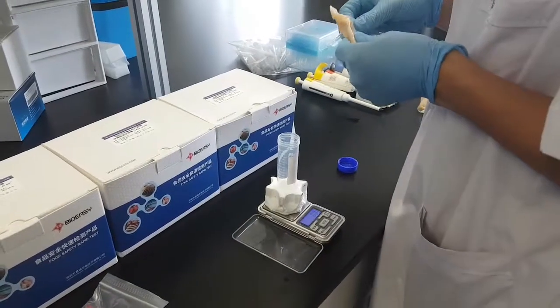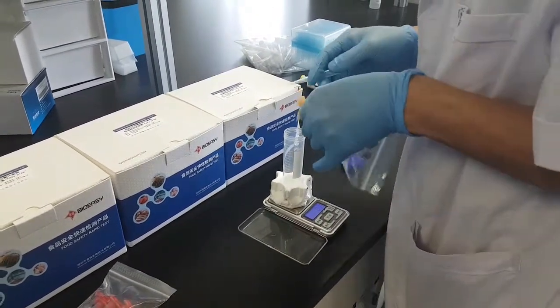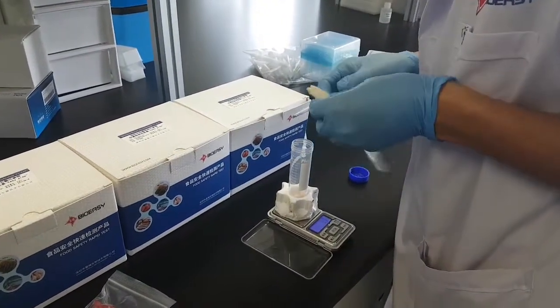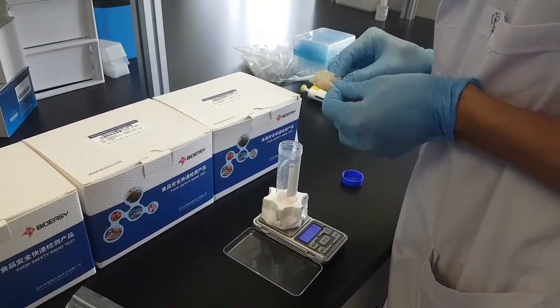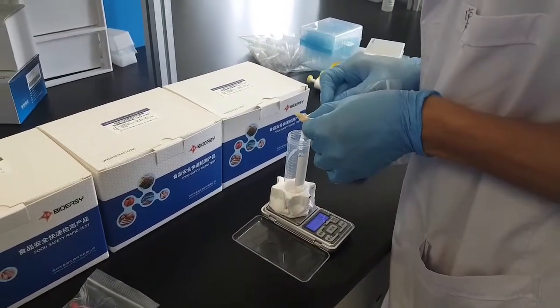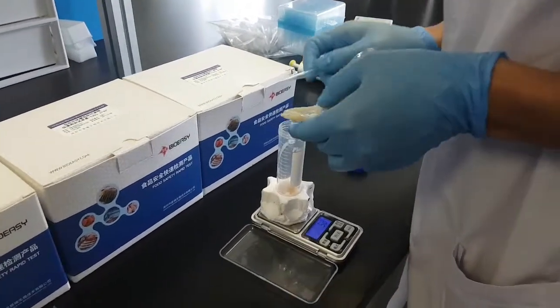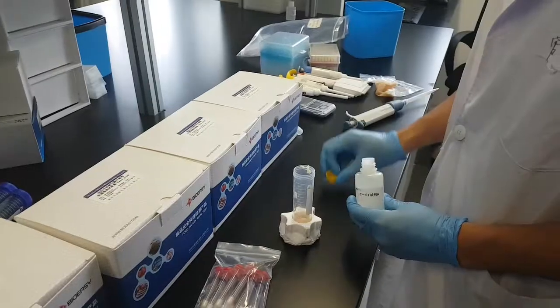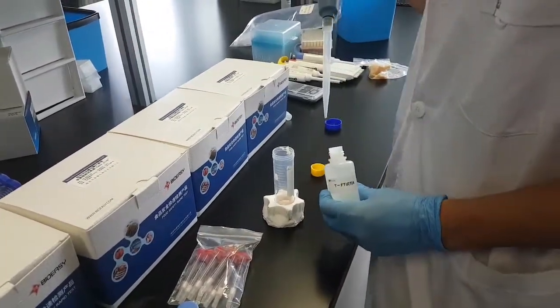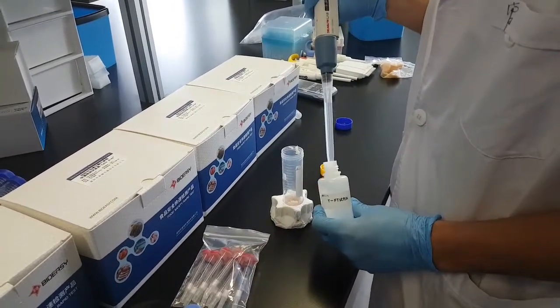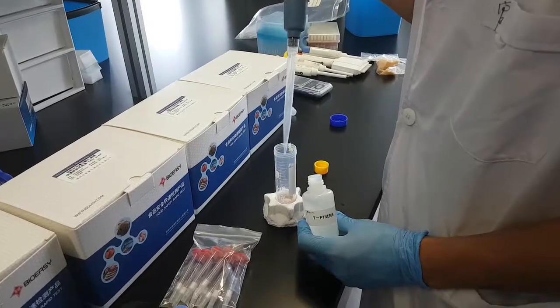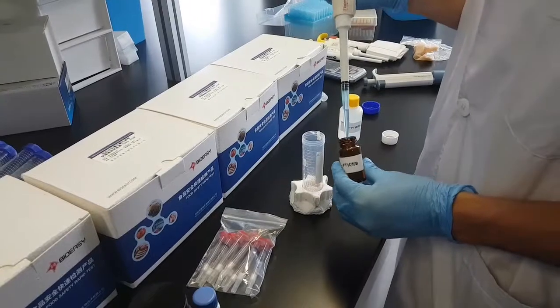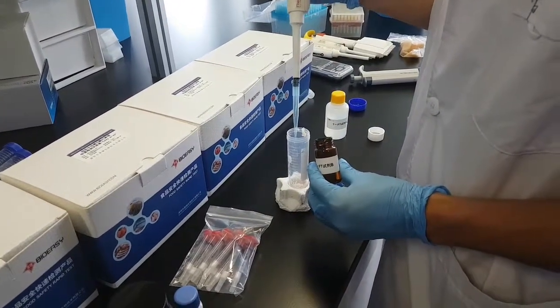First step would be sample preparation. We'll weigh six grams of homogeneous tissue sample and put it into a 50 milliliter centrifuge tube. Our sample here is chicken. After weighing our sample, we'll put five milliliters of reagent A to the centrifuge tube, 800 microliters of reagent B as well.